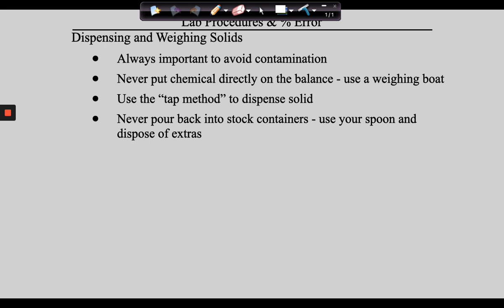Now, guys, what happens if you go past a gram? This is where it depends. If you brought this scoop with you, then this cannot go back in there. If this came with the beaker, then it's clean and you can put it back. And this one did, so we're good.